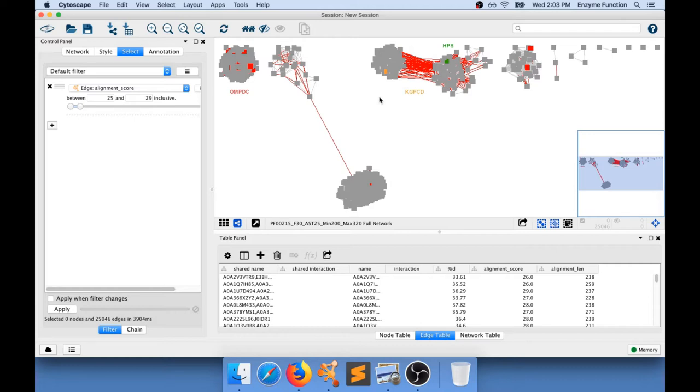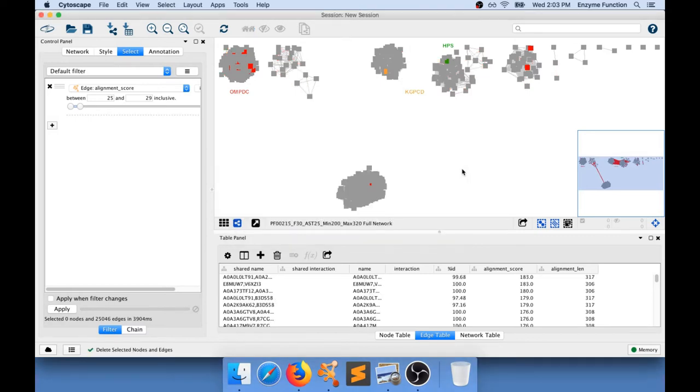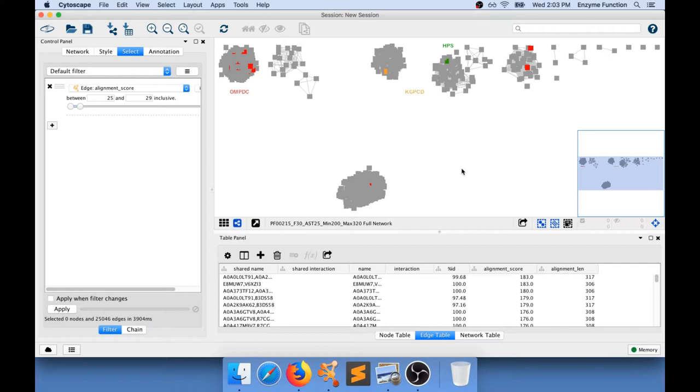And if you go to the EFI website and generate the same network at an alignment score of 30, these two sub-clusters that were connected will actually not be connected anymore. And this is what we aim for. We want to have an alignment score which is the lowest that allows to separate different SwissProt annotations into different clusters.